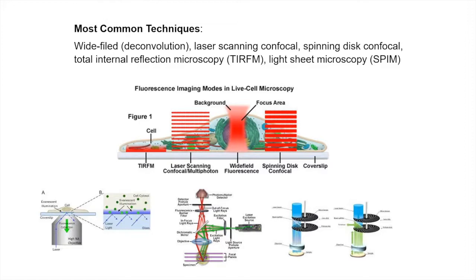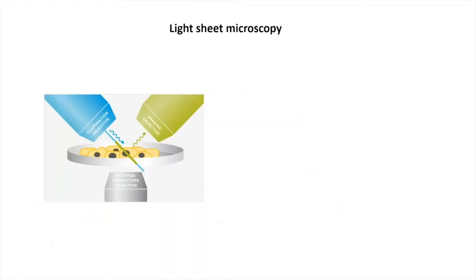As an add-on, there is a new exciting technique, light sheet microscopy, or selective plane illumination microscopy, whereby a narrow light sheet of roughly a micron or less in thickness is created. It can scan the cell and selectively excite fluorophores across the cell, as opposed to selective excitation of fluorophores at the basal membrane. This is really a powerful technique that promises to revolutionize the field, especially for small animal tissue imaging as well as single cell imaging.